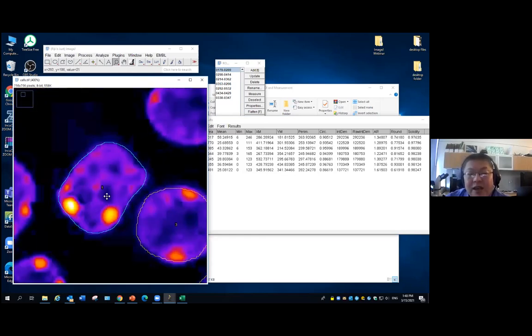So when we're looking at what we call a digital image, you already get a picture from the camera or by any scanning mechanism. All you get on a single image is a 2D matrix. You have a certain number of pixels in the x direction, and a certain number of pixels in the y direction. Currently, we know how many pixels are here. Looking at this image, we have 756 pixels in the x direction and 756 pixels in the y direction.